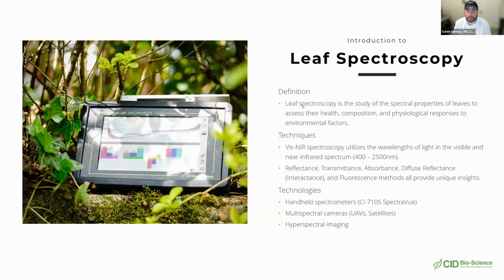The next question is, is there an influence of the environment when taking measurements? For example, sunny versus cloudy days, or even how you're holding the device. So the environment has no impact on the actual measurement itself. Now, for a sunny day or cloudy day, the thing that could impact it is a wet leaf. If it rained and you didn't dry the leaf off before you measured it, that external moisture is going to impact the measurement.